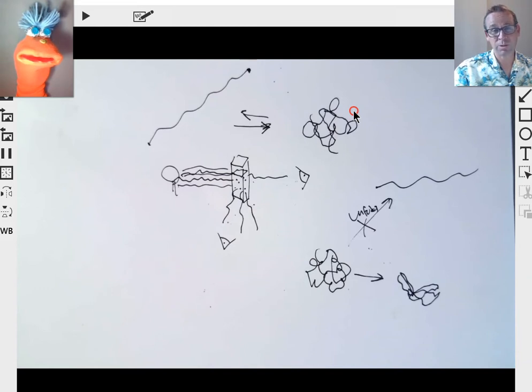but sometimes those chemicals are pharmaceuticals that are not soluble in water. A lot of pharmaceuticals aren't very soluble in water, and so to perform those reactions, you need to have something to help. And DMSO can do that. DMSO is an organic solvent that is soluble or miscible, we say, with water. Miscible is when you take two solvents and combine them together.